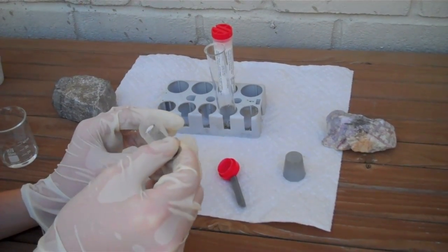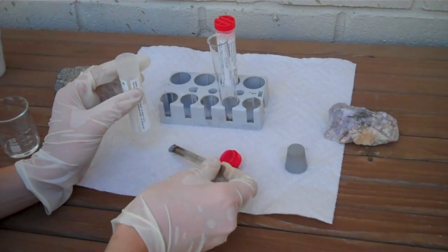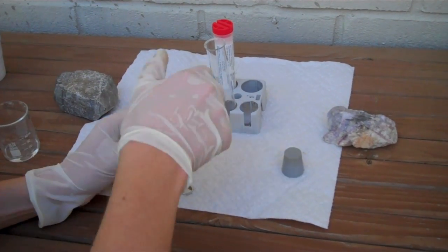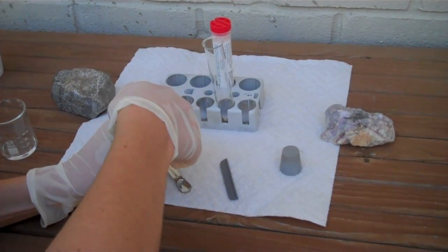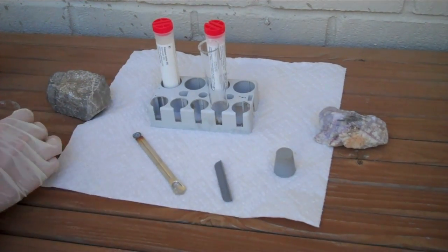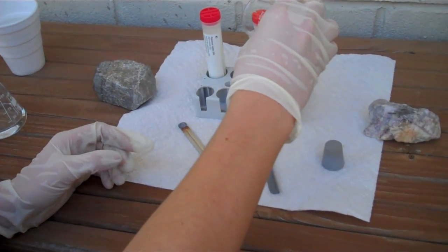Now take a small amount of potassium iodide and add it to a test tube or a beaker or a flask. It doesn't have to be a small amount if you want to make a large amount of iodine. You can scale up this reaction. Now add some water to dissolve the potassium iodide.